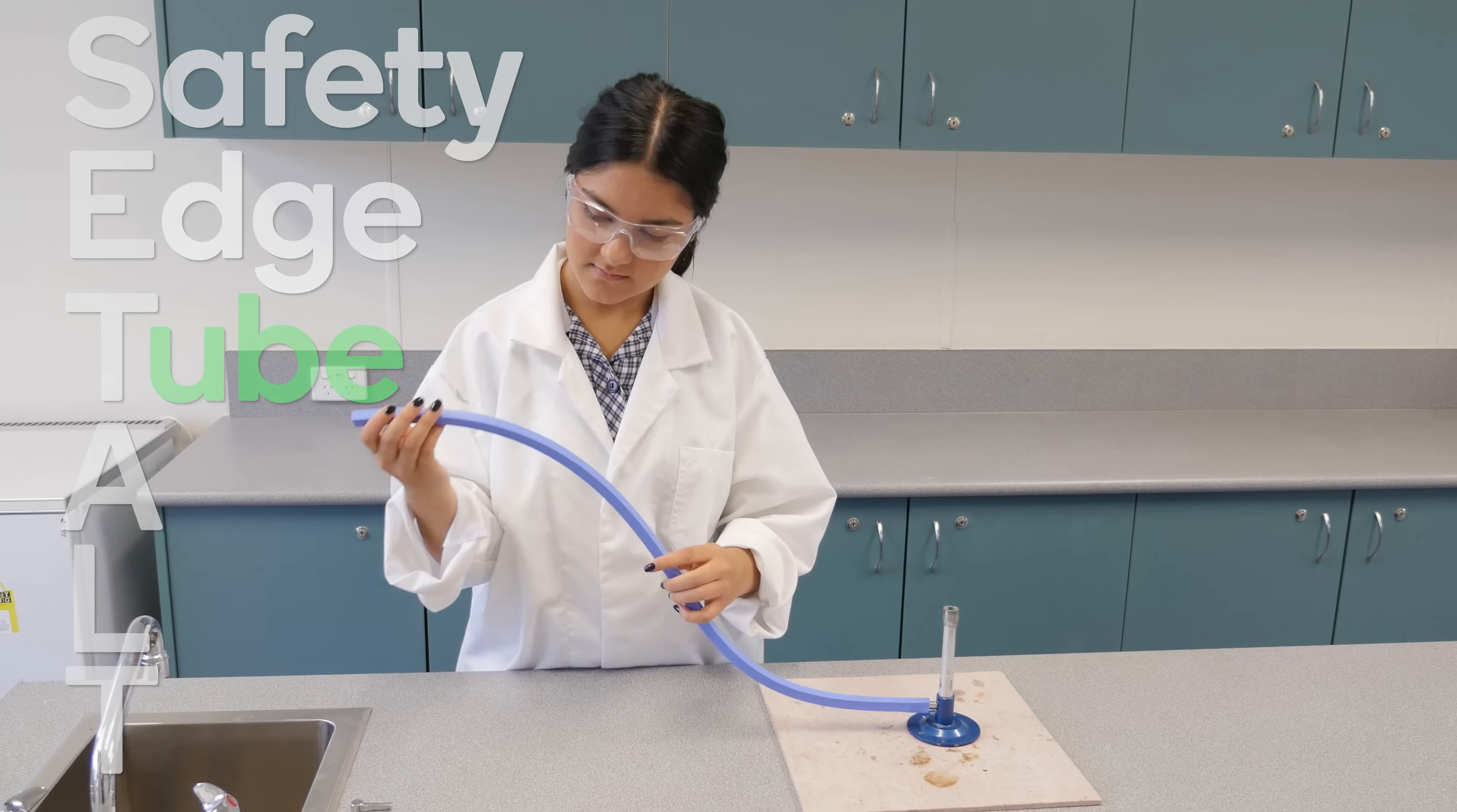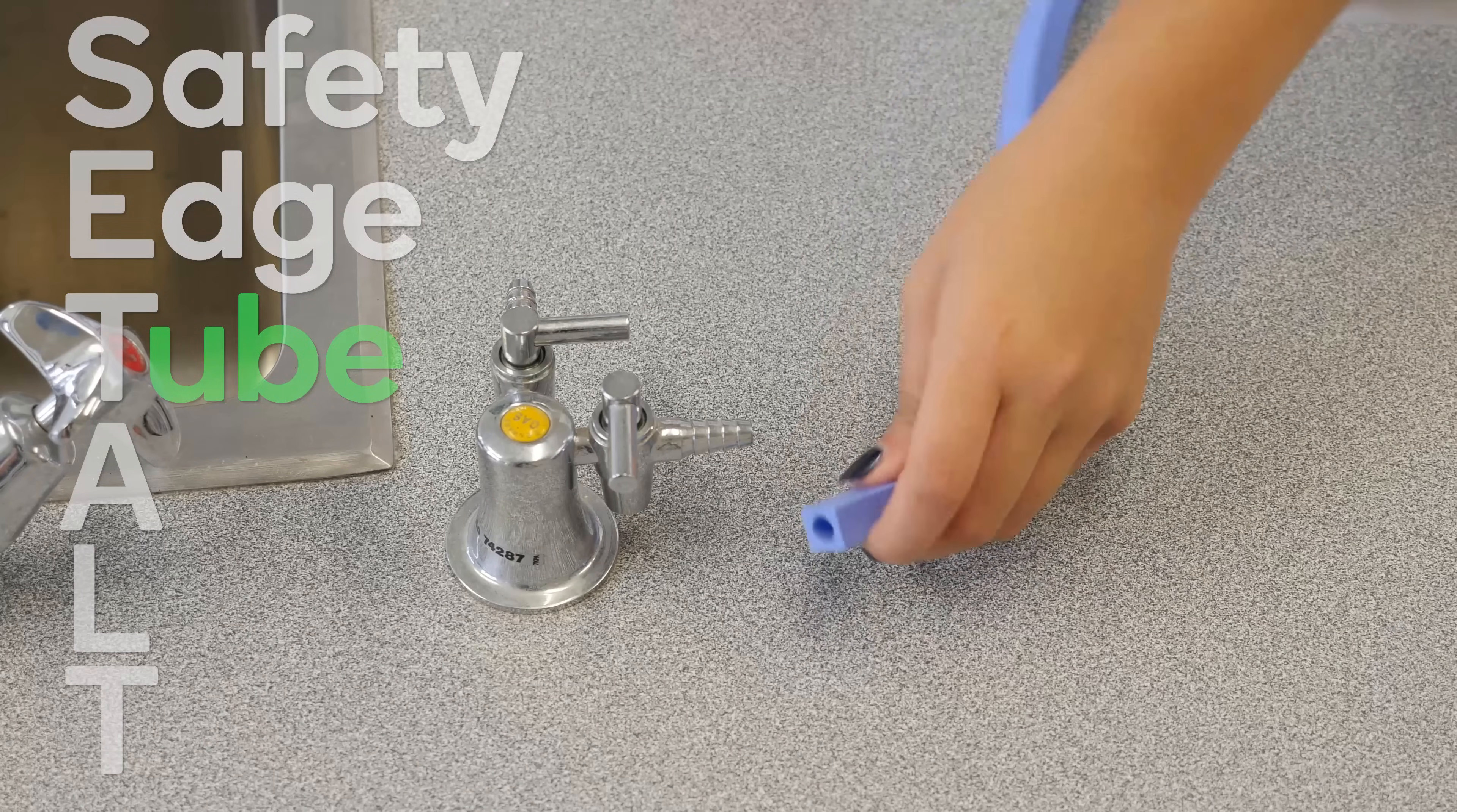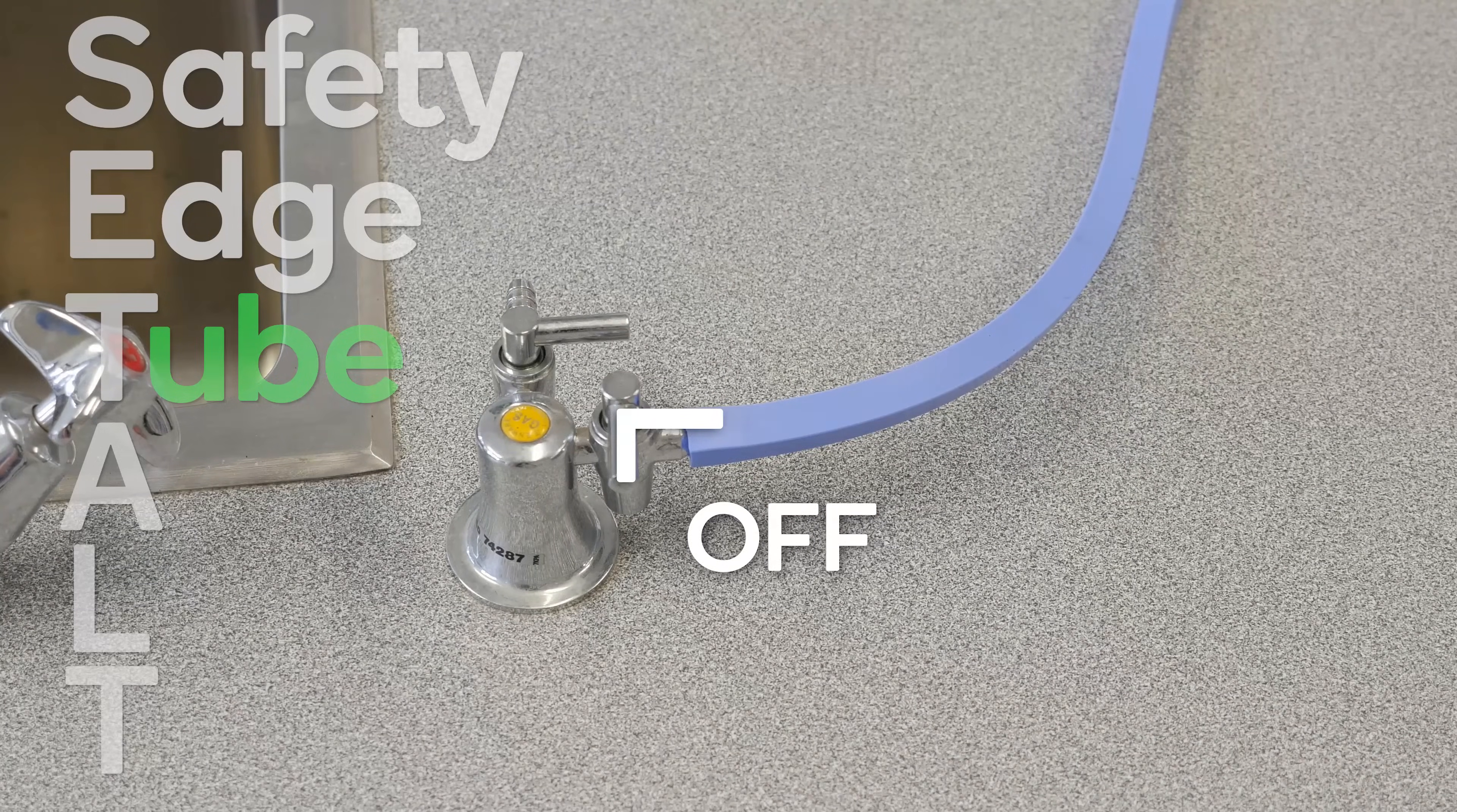T is for tube. Check that the rubber tube is free of cracks. Connect the tube firmly to the gas tap. Make sure the tap is in the off position. Remember, the off position makes an L shape.